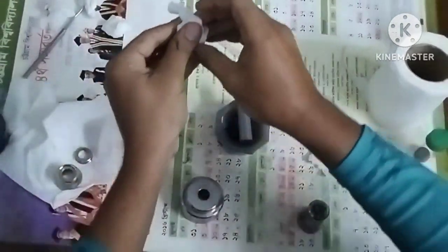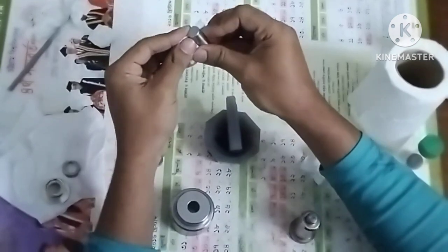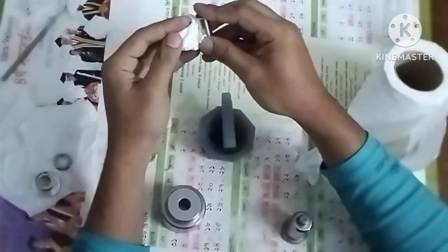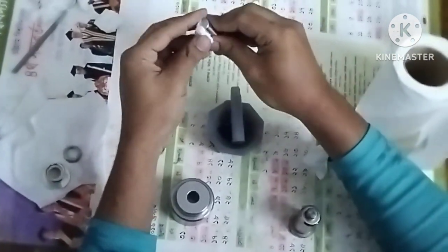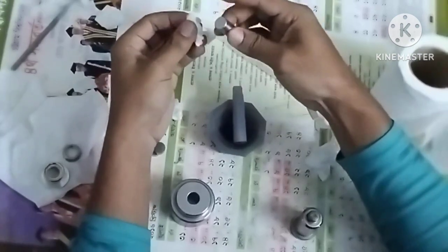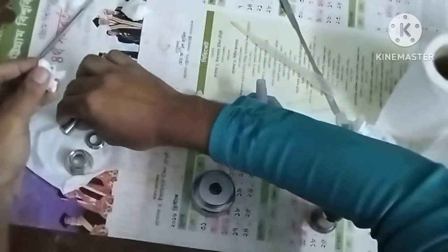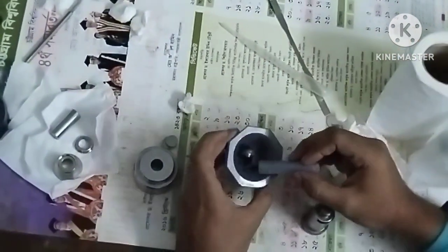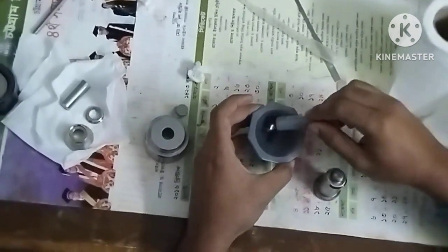At first, we will clean each and every component that is essential for FTIR spectrometry. We are cleaning because if any chemical substance exists here, it will show extra peaks in the IR graph. So it will create complexity. At first we will create the KBr, or potassium bromide, plate for this.